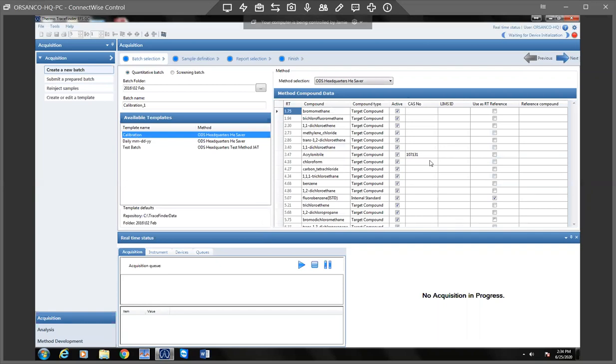And here again, it's pre-programmed to bring up the 30 calibrated compounds that we have. One thing I didn't quite point out is that this is your method. So this is a pre-programmed method that we've created. Usually we'll just use whatever's defaulted, but they can change, but usually once we find a method that works, we pretty much stick to it. So just go with your default unless for some reason it's been changed. And you can see here, it'll tell you which method is set as default.